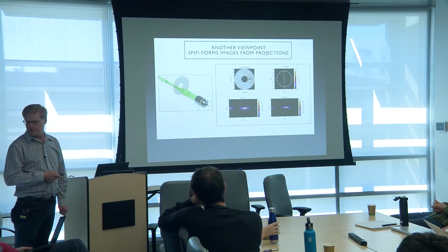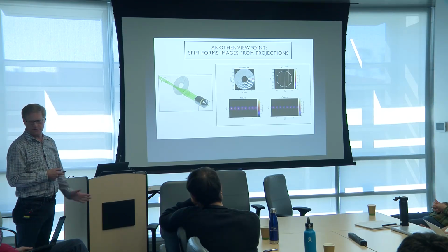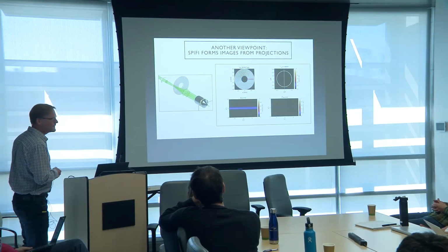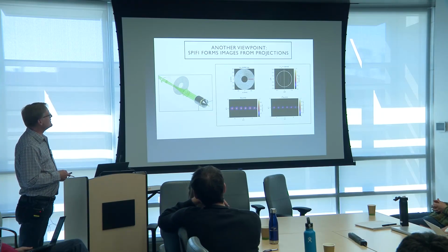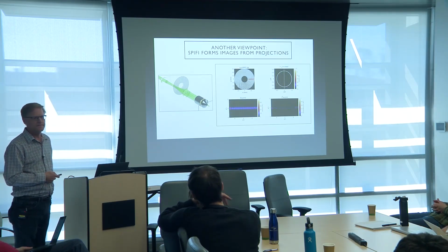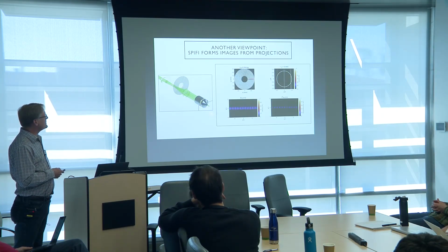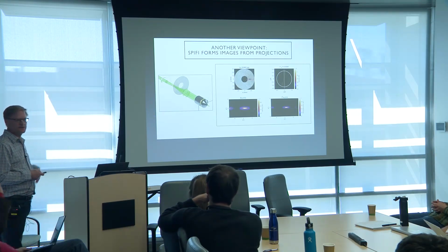It's an absorption mask, right? No, it's amplitude. So it transmits at the white and reflects, scatters the light on the black part. Got it. So this shows the scan basically the x-axis, right? Yeah, so we're going to have high NA along the y direction, and an extended field of view along the x-axis. So there's no scanning in the y-axis? Yeah, no, you do. It's oversimplified. So you either scan the specimen or you add a system in there to scan that beam.